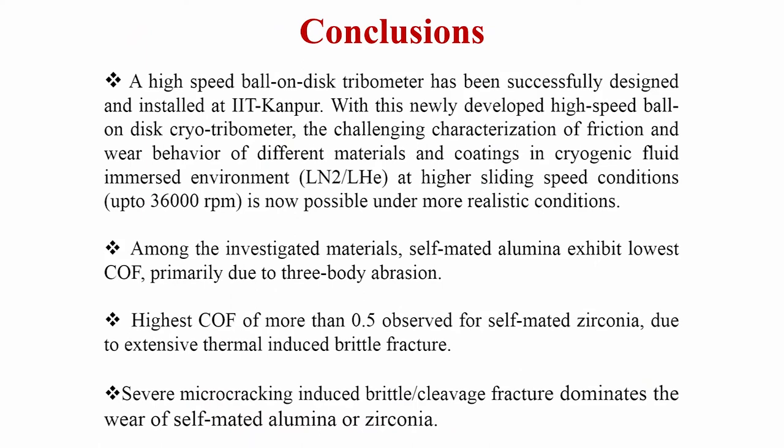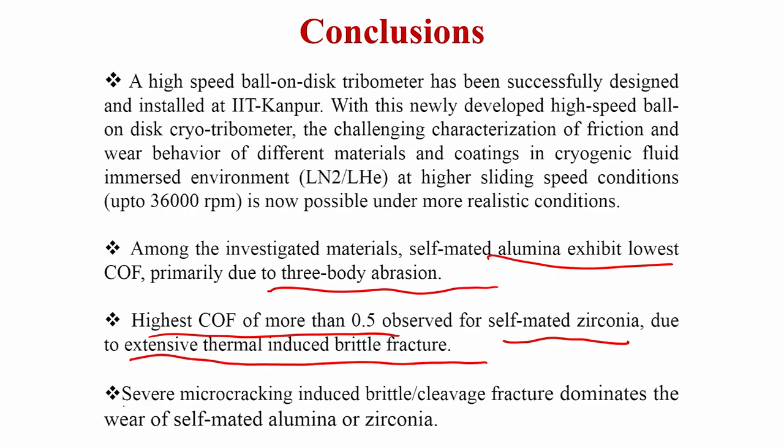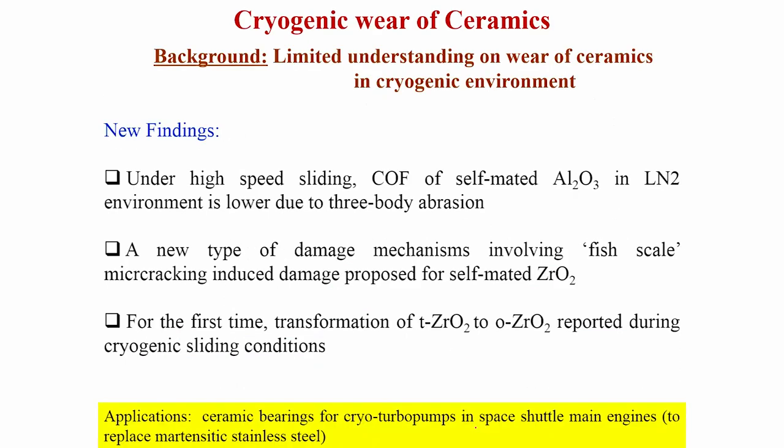So, these are the conclusions. A high speed ball and disc tribometer has been designed, fabricated, and its performance tested to study the sliding wear of self-mated alumina, self-mated zirconia and self-mated silicon carbide. Self-mated alumina exhibits the lowest COF primarily due to three body abrasion, and the highest COF of 0.5 is observed for self-mated zirconia. Extensive thermally induced fracture, severe microcracking and cleavage fracture dominate the wear of self-mated alumina or zirconia. And this is the key summary on the cryogenic wear of ceramics.